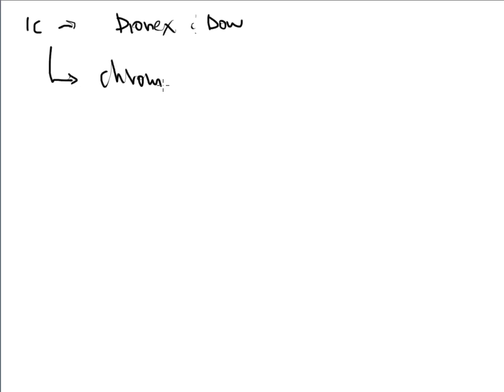All right, so I'm going to first start with this word chromatography. We keep seeing this word over and over throughout the course. And chromatography systems are very similar to each other with just slight modifications. That's really all that we have to worry about. So the good news to you is that if you understand GC, then this is kind of equivalent to IC as well. And that would be kind of equivalent to HPLC and to TLC. You're going to find some common trends with all chromatography, whatever kind of instrument that might be.